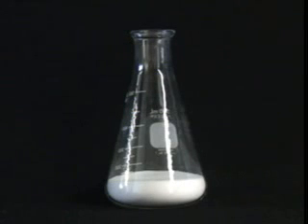Weigh the silica into an Erlenmeyer flask in the hood. Use a flask large enough that you don't fill it more than one-third full.